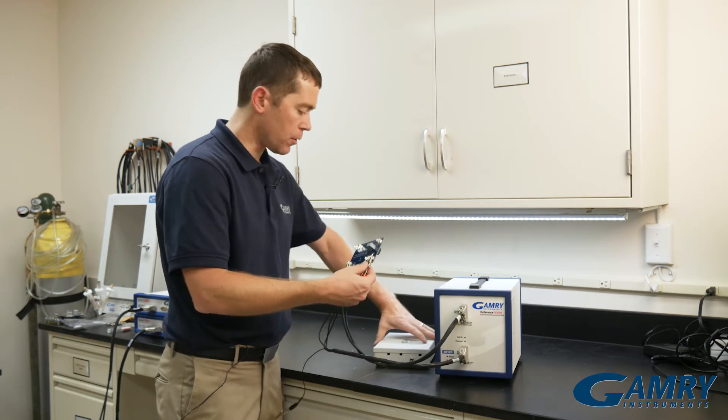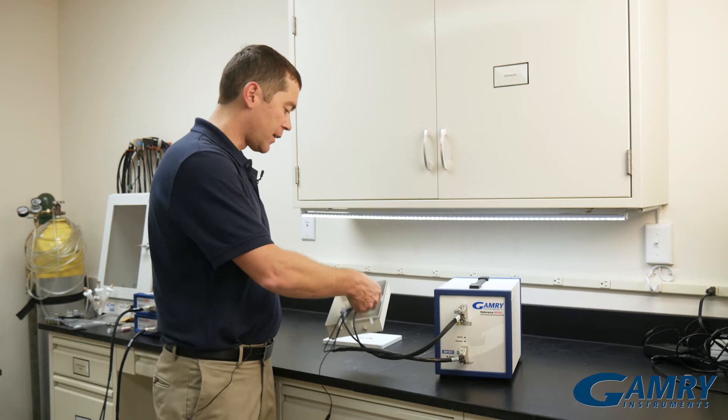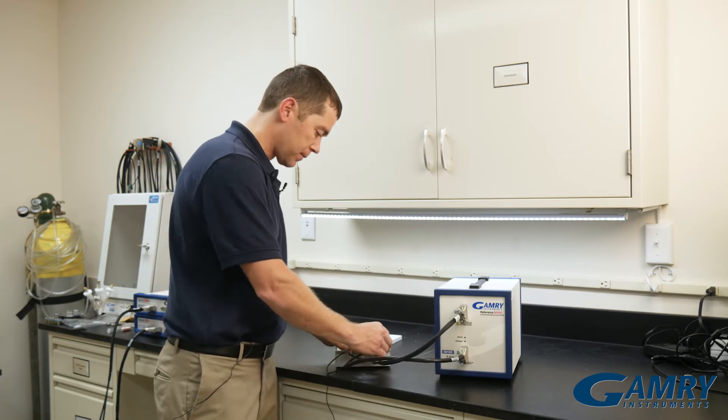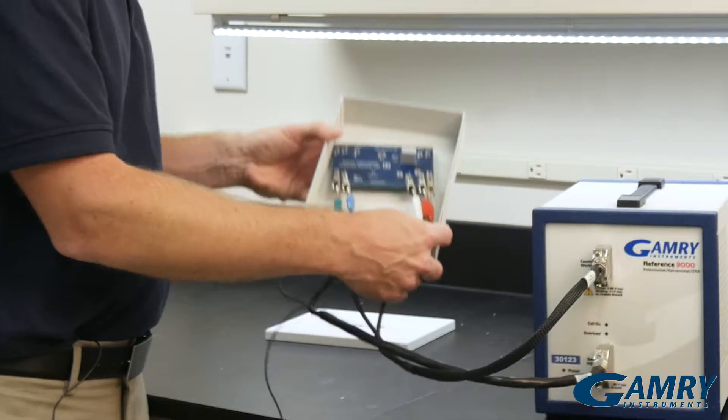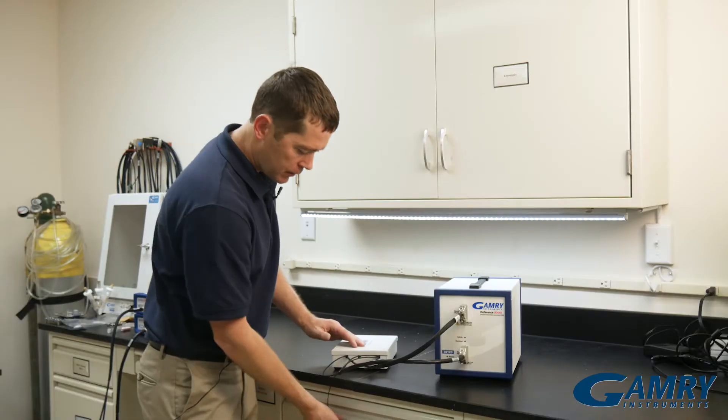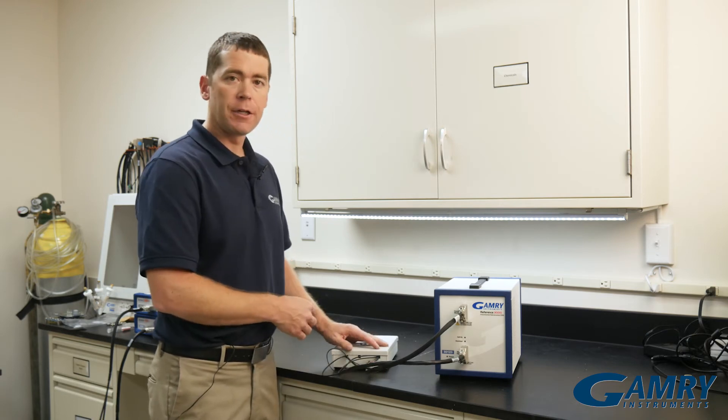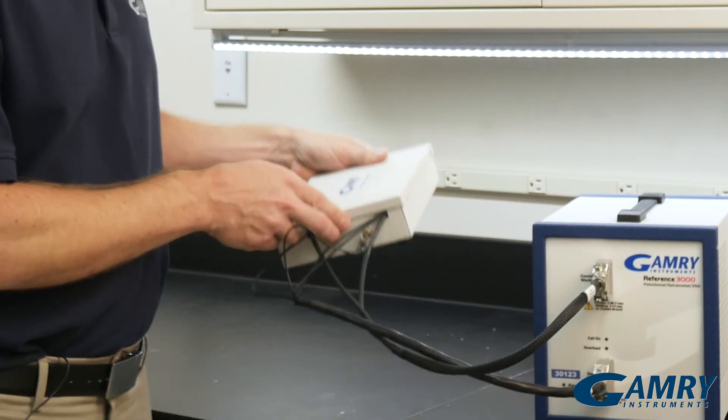Then we take our calibration board and put it inside our Faraday cage, our little calibration shield. We place it in there, we put the lid on it to complete the shielding, and then we take our floating ground and connect to the floating ground connection that you can see here.